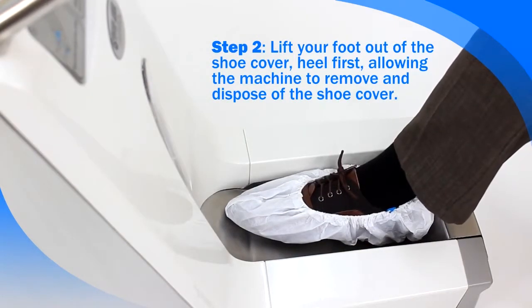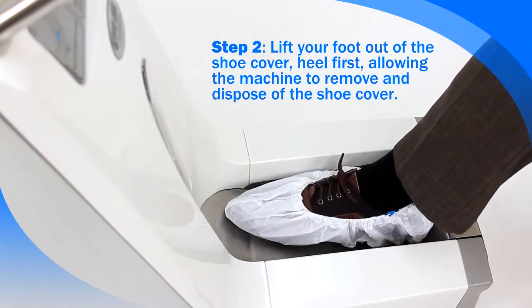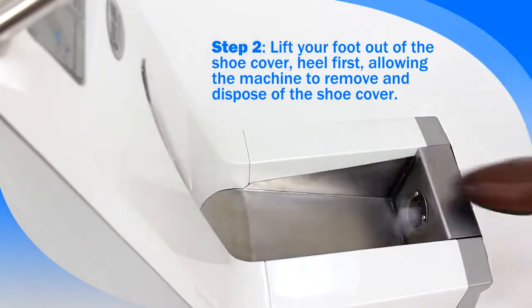Step 2: once appropriate suction is achieved, lift your foot out of the shoe cover heel first, allowing the machine to remove and dispose of the shoe cover.